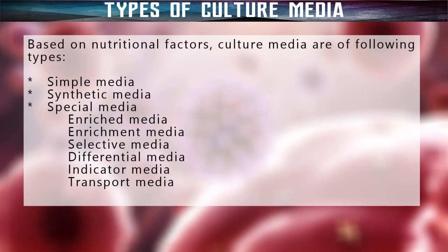And when 2 to 3% agar is added to nutrient broth, it becomes nutrient agar. This is the simplest and routinely employed medium in the laboratory for diagnostic purposes. If the concentration of nutrient agar is reduced, a semi-solid medium is obtained, which enables motile bacteria to spread.